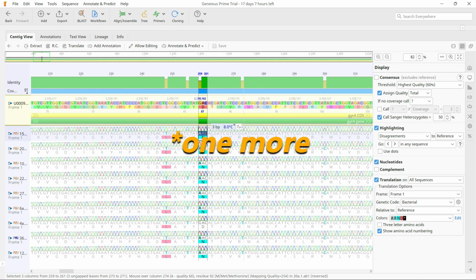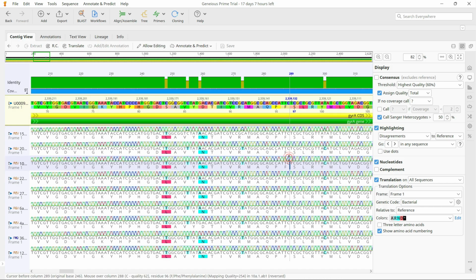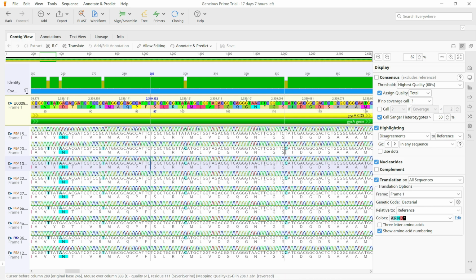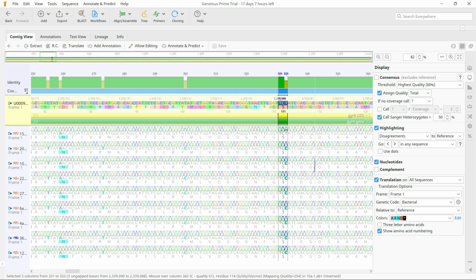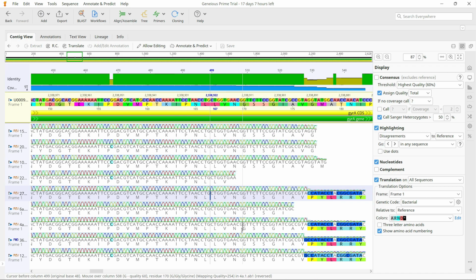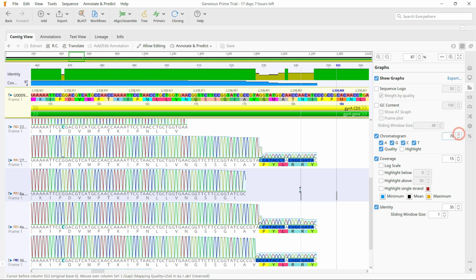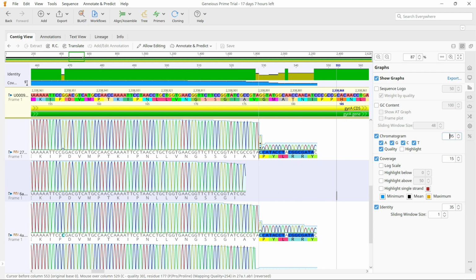There are a couple more missense mutations here and a few more silent ones. Silent mutations are those where the third base of the codon is mutated. Due to the plasticity of the third base of the codon, its mutation often remains silent. We found a bag of missense mutations at the end of our sequence, but as always, we are not counting those. Thank you for your time.